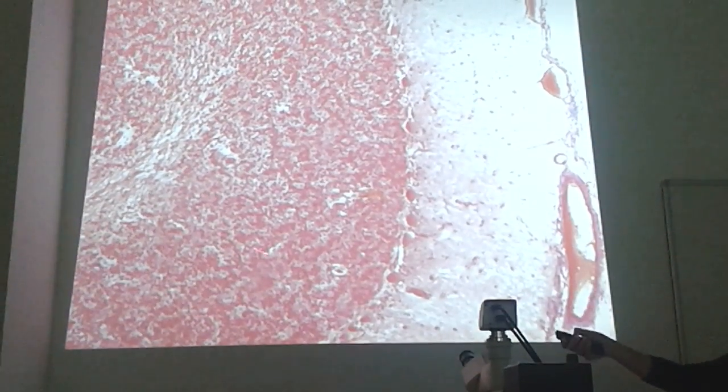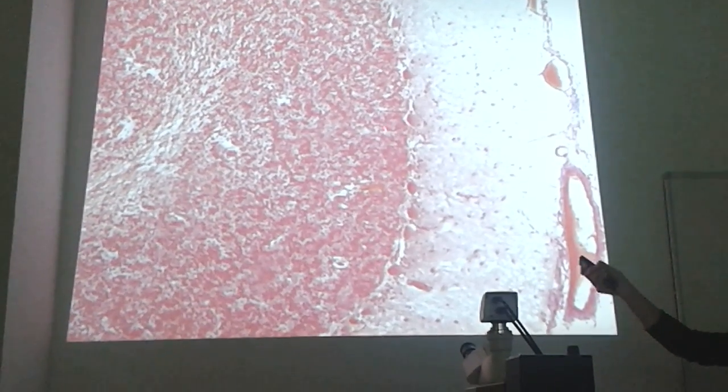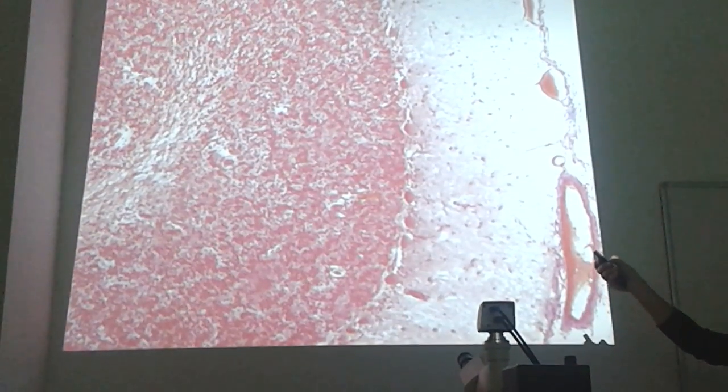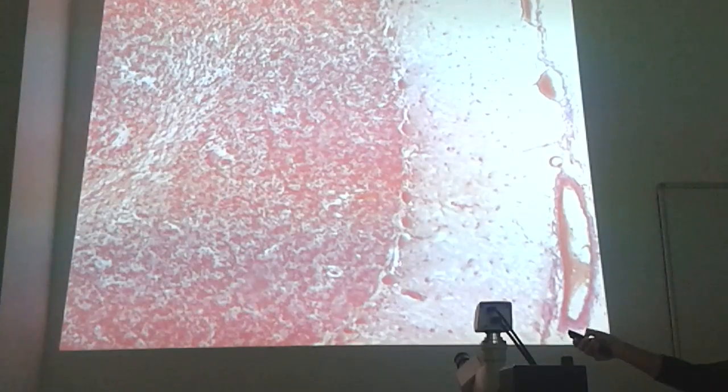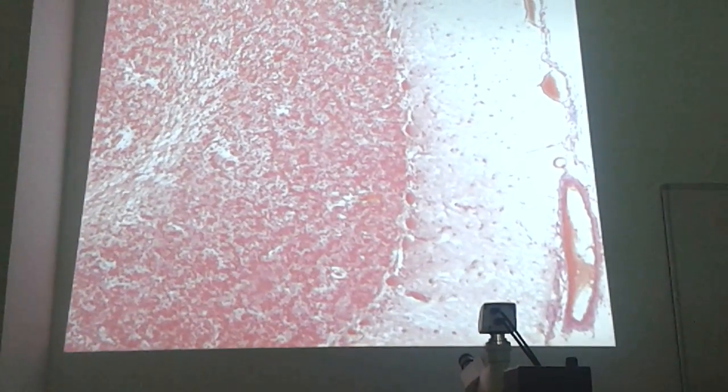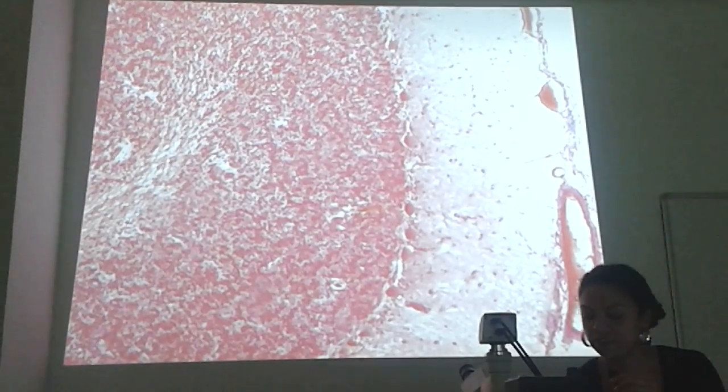Between the granular layer and the molecular layer, there is another distinctive cell layer, the Purkinje cells. It's a definite question. These Purkinje cells are located in between the molecular and granular cell layer.